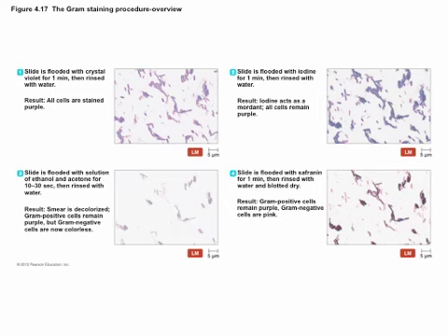So why doesn't the gram-positive cell look pink? There's a thicker cell wall. It's still got the purple. This purple is a lot darker a color than this pink. So if you've ever looked at a gram stain and you said, God, why is that pink color so light? It's hard to see. That's sort of on purpose. I mean, not exactly on purpose, but it's helpful. Because that means that this purple is going to completely overwhelm the pink tinting of the inside. Whereas here, you see the pink because the pink is all that's there.